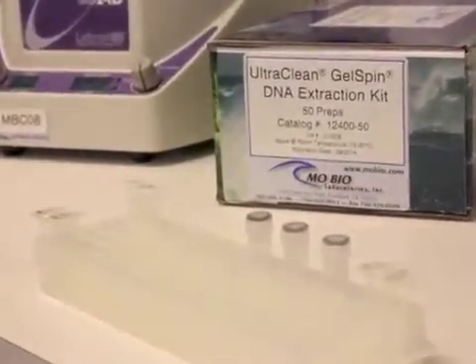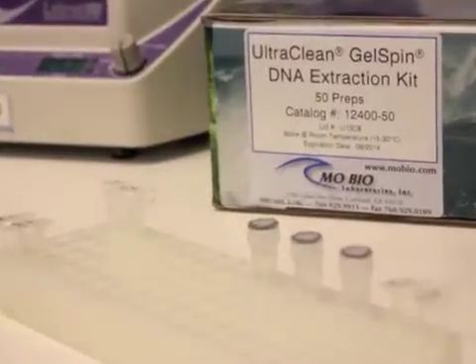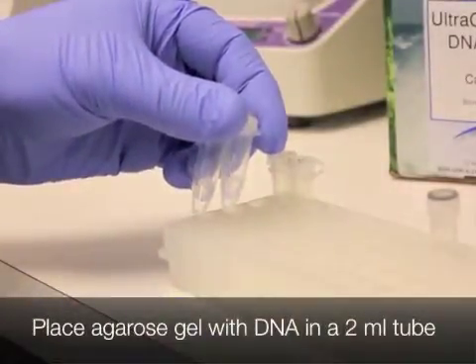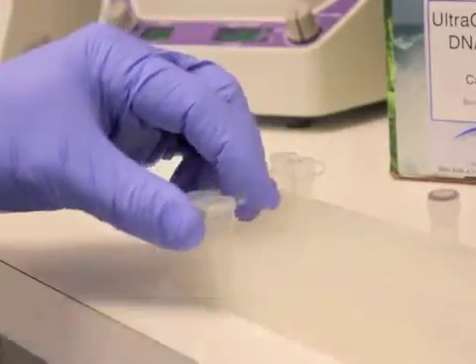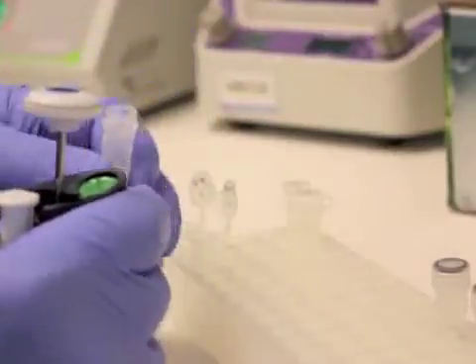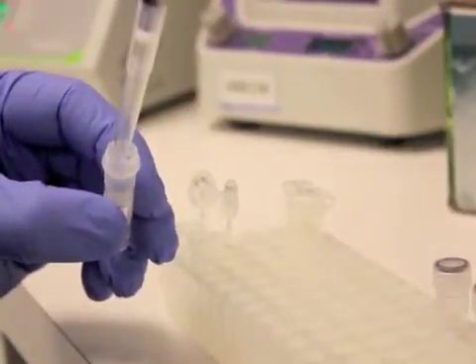This is a visual protocol for MO BIO's UltraClean Gel Spin Kit. Place the agarose gel band that contains your desired DNA in a 2 ml tube. Add three volumes of gel bind solution to each tube. This solution is provided with the kit.